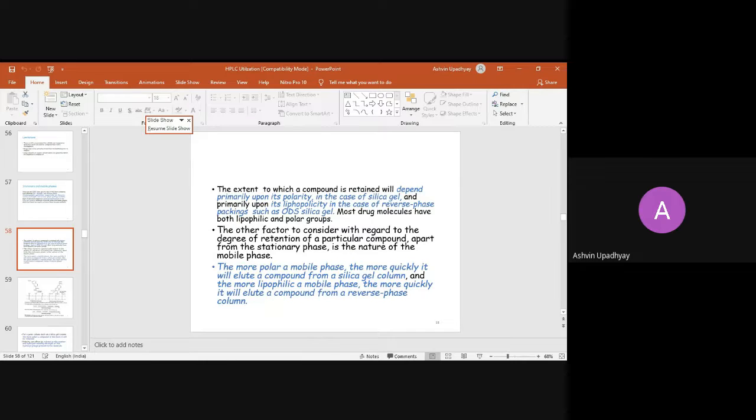So mind well, the HPLC instrument is the most sophisticated. By utilizing this instrument, you have to focus on the proper separation, the proper elution order of your impurities, and then you may find the proper solution for your methodology. So again, that is a different part, the method development activity.